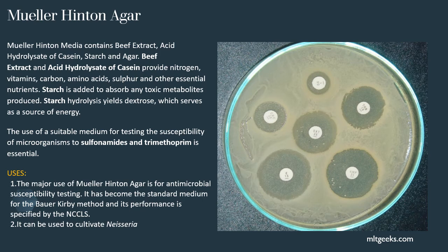The major use of Mueller-Hinton agar is for antibiotic susceptibility, and it has become a standard medium for the Kirby-Bauer method, and its performance is specified by the NCCLS. It is also used for cultivating Neisseria.